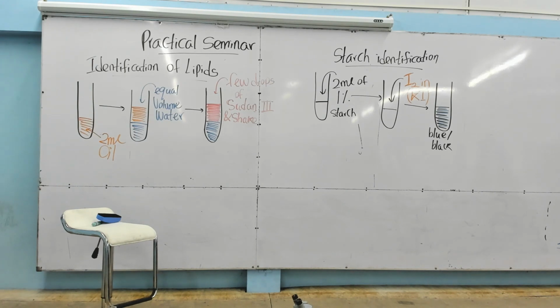So you can see I added a bit too much oil, right?